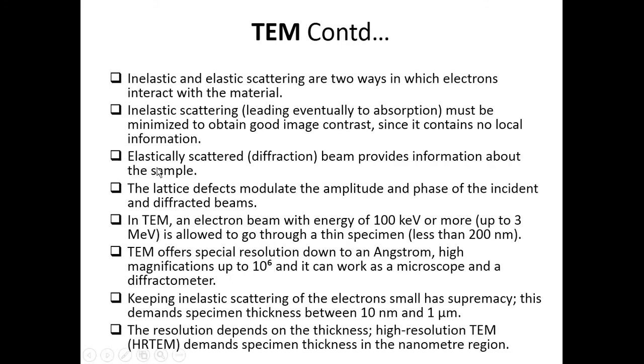Okay, but what about the elastically scattered beam? Elastically scattered, that is always subjected to diffraction. That is very important. Why is the elastically scattered beam very important here in TEM? Because the elastically scattered beam always undergoes diffraction, which provides information about the sample.